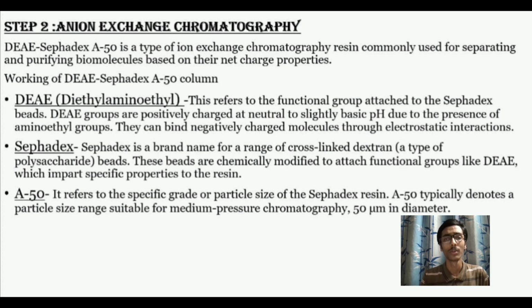First, Sephadex. It is a range of cross-linked dextran beads which are chemically modified to attach functional groups like DEAE, which impart specific properties to the resin. A50 refers to the particle size of the beads. DEAE, diethylaminoethyl, refers to the functional group which is attached to Sephadex.